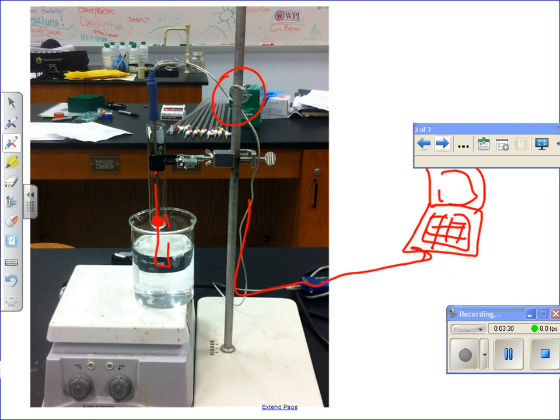Once it completely liquefies, you're going to pull it back out above the water bath and let it cool. During that time, you're going to use the thermometer you see in the picture here to stir it. So you're going to stir the solution not in the water bath. The only time we use a water bath is to liquefy something so we can see when it cools. The cooling point for it normally is around 68 degrees Celsius. So you'll continue to stir it.